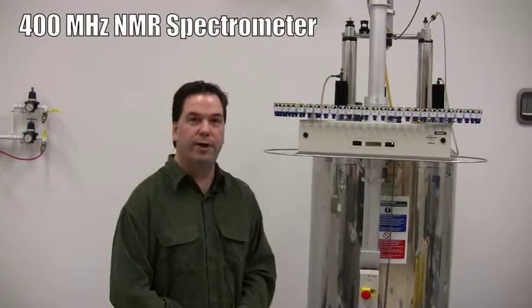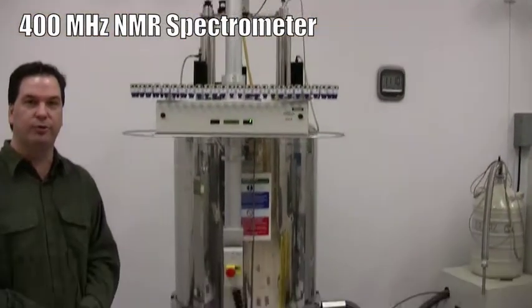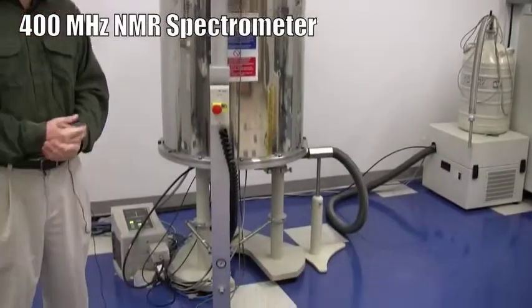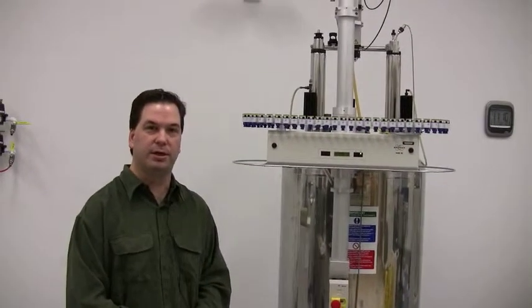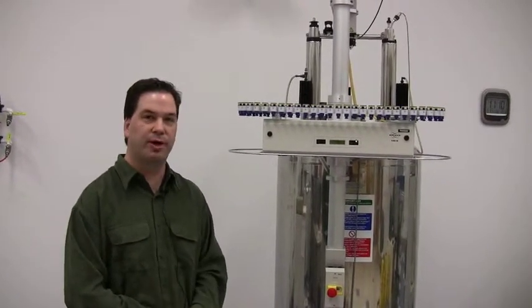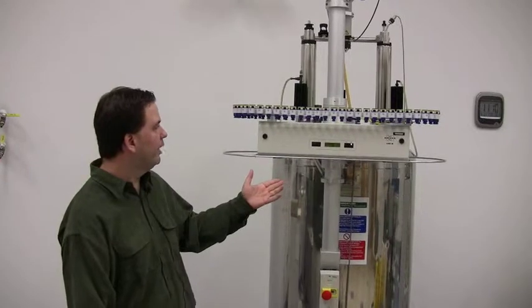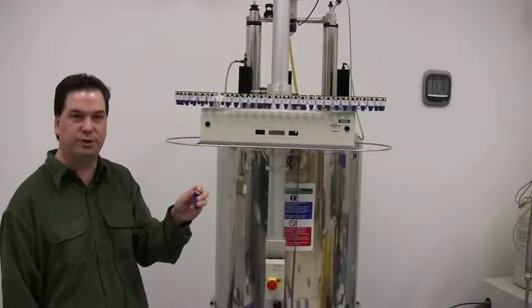This is our 400 megahertz spectrometer. It's also primarily dedicated to what we consider walk-up time or high-throughput sampling. Students who are typically concentrated for both proton and carbon access this spectrometer. As you can see, we also have what's called a sample changer or a 60 sample sample changer for the spectrometer.